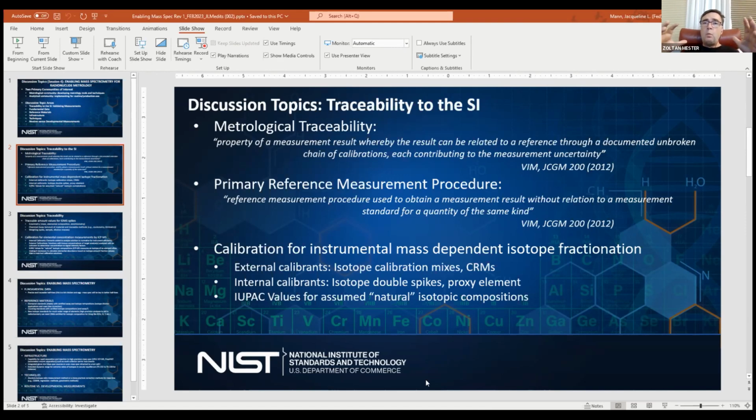So the question is, what is a useful uncertainty, and whether that chain concept of linking back to a primary calibrant is maintained within the uncertainty realm. What is useful for the end user.